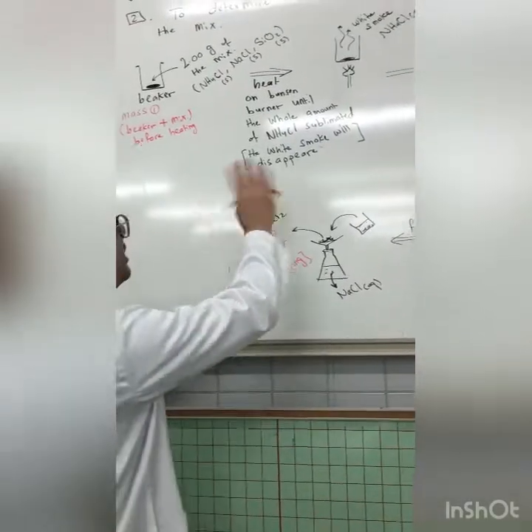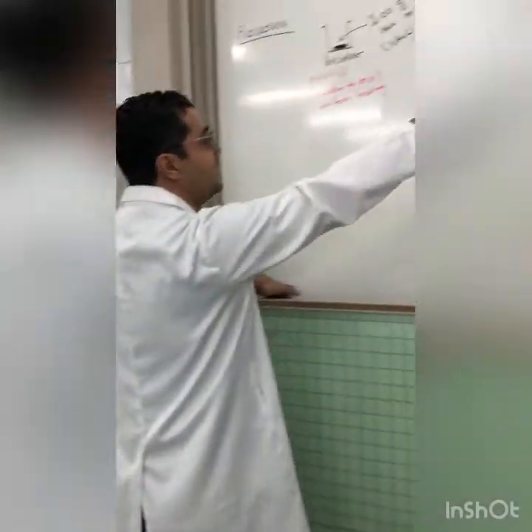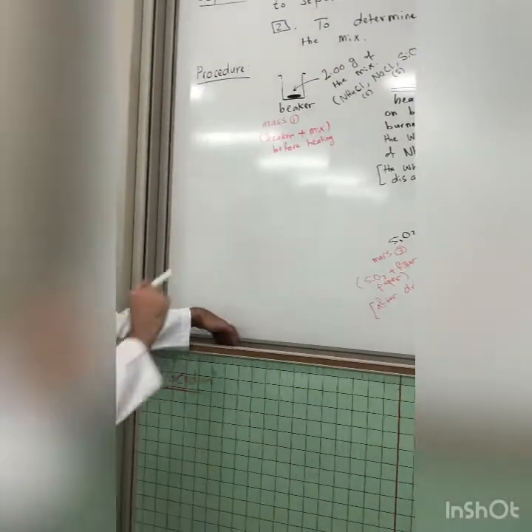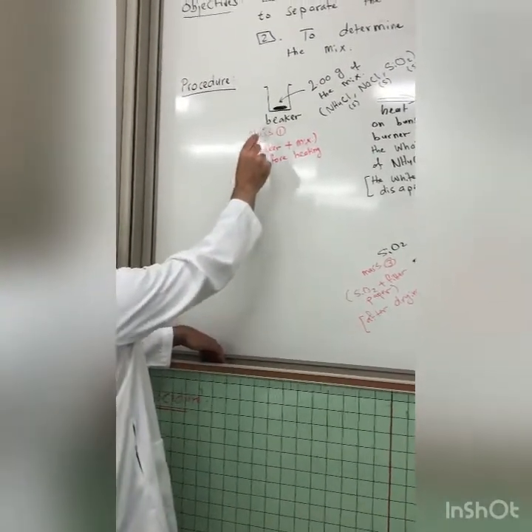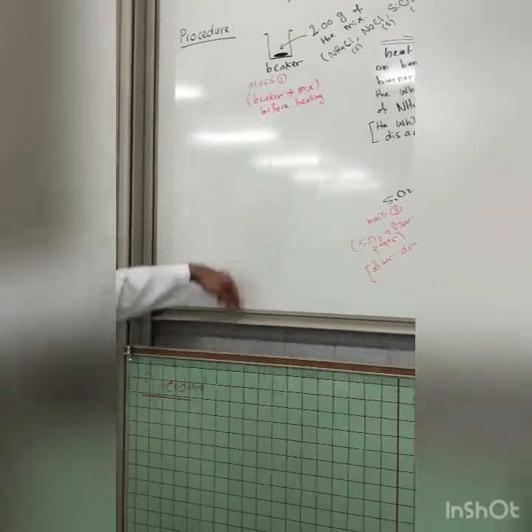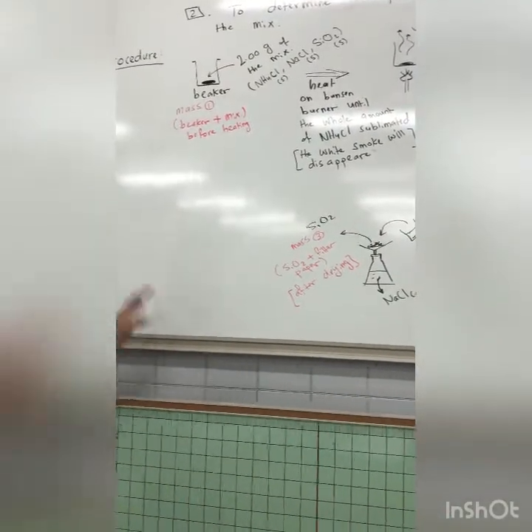Before doing anything, the determination of percentages of each component is important. Do not do any single step before recording the masses — weighing everything accurately is critical. So first, we record Mass number one, which represents the mass of the beaker plus the two grams of the mixture inside it. We will use this in the calculation part.